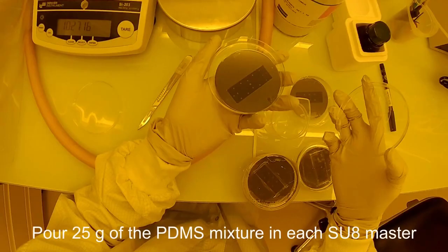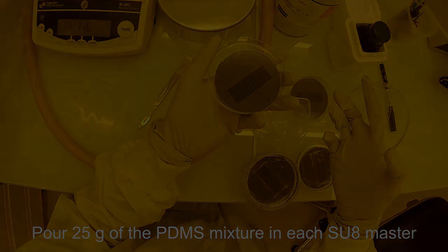Pour 25 grams of the pre-mixed PDMS into the first SU-8 master containing the patterns of the microfluidic channel and the pillars up to a height of approximately 5 mm. Then pour the remaining 25 grams of the PDMS.